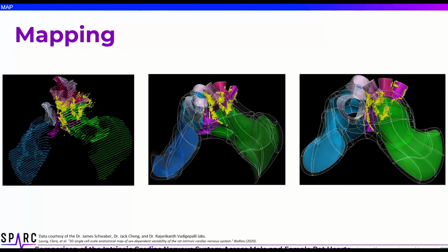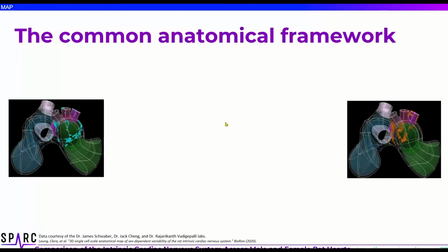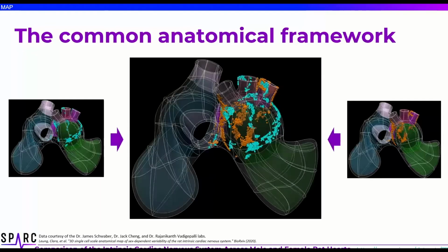Remember, because the surface of the fitted scaffold now represents the anatomy of the data, the coordinates effectively identify the position of any tissue particle independent of its location in 3D space or how distorted it is. So, deforming the scaffold back to its in vivo configuration moves any mapped ICN data while respecting their anatomical locations. So at the end, this process will now allow for comparison across different subjects by bringing all the data into one integrated scaffold. And that's the beauty of it all.